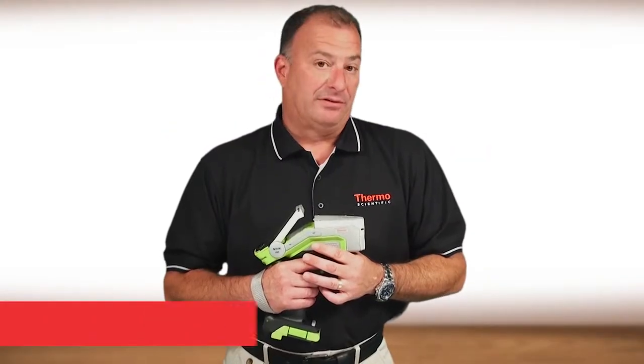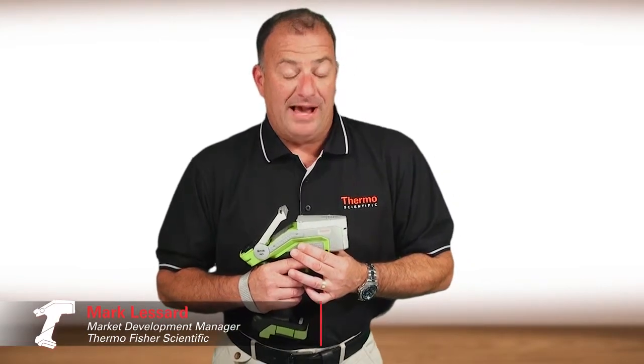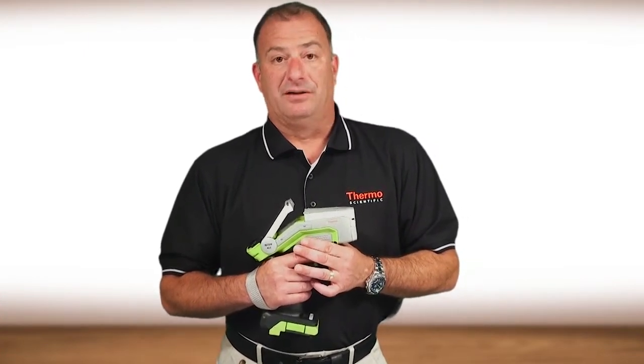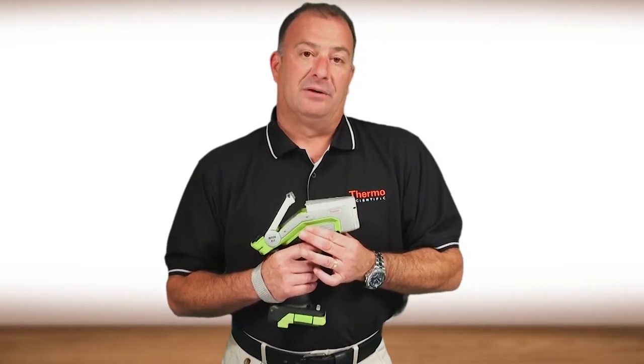I've been involved with all aspects of XRF for a long time now, nearly 30 years. If you asked me just a little while ago if I thought it was possible to achieve the level of performance we've achieved with the Thermo-Scientific Niton XL5 analyzer, I would have doubted you.